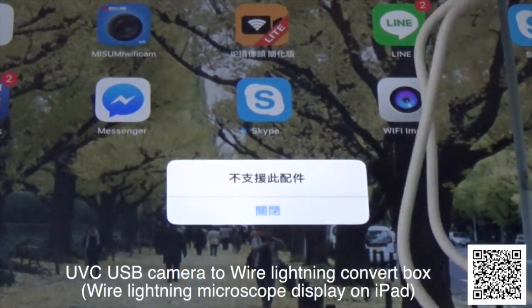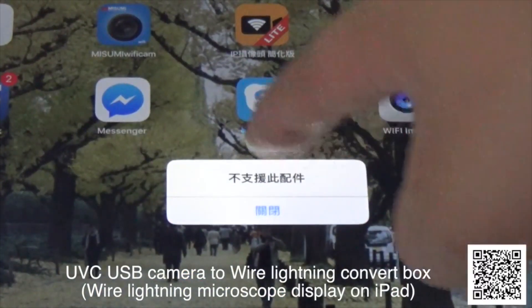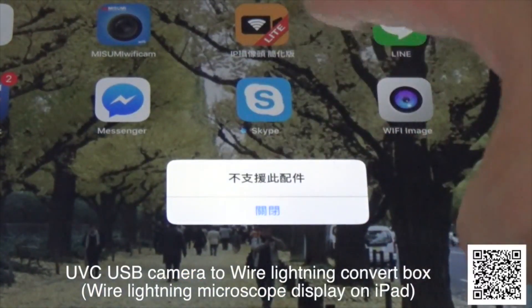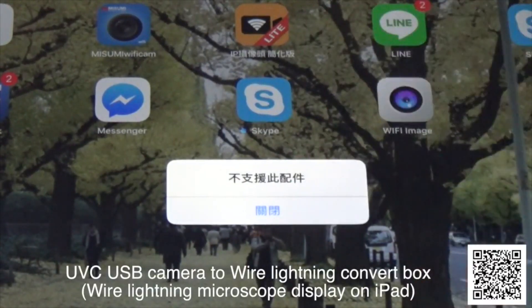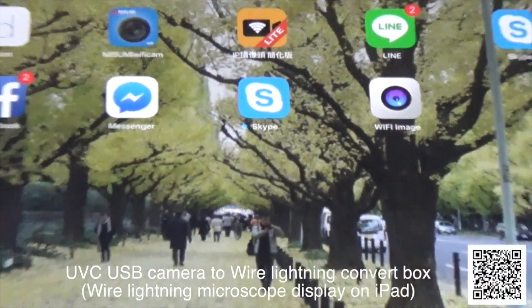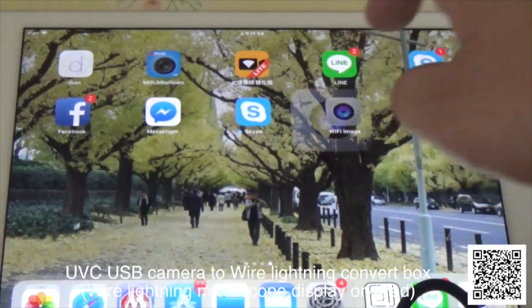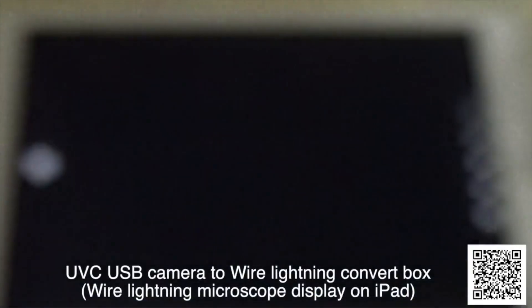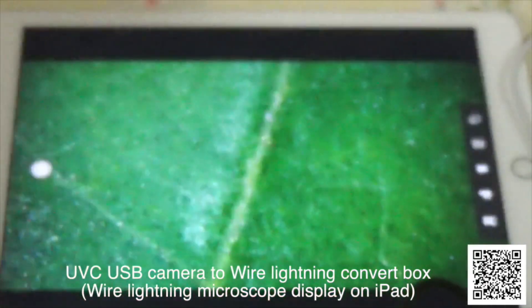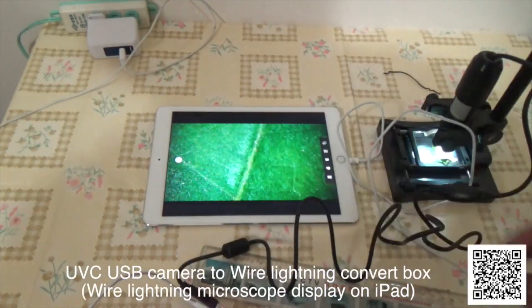You will see an error message. The error message means the device cannot support this iPad, but do not worry about the message. Do not care about the message. Open the app. This is a microscope.